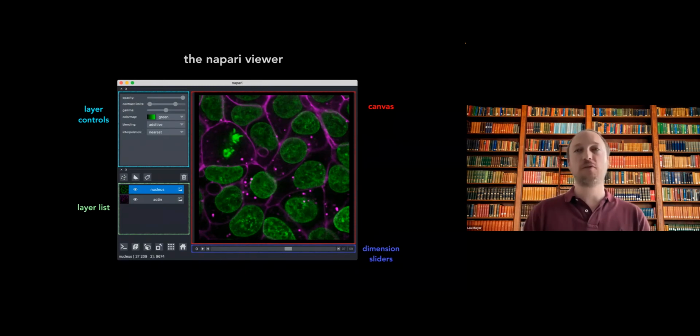That's what this slider does. It lets you slice through the dimensions. We had some ideas of being able to do max projections through a double slider, and some crazy ideas, but there are some performance limits there. We wanted to be even more innovative there, but there have been some limits, and at some level we're still thinking about how to push them.